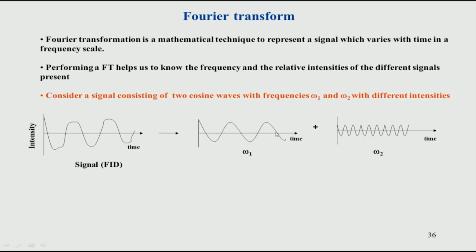You can see the frequencies are not the same now because they are two different atoms in the same molecule, and therefore, they have two different frequencies. These two different frequencies also have different amplitudes. You see the height is also not the same here and here. That is because this particular frequency may come from 3 hydrogen atoms, so 3 times the signal of this one, which may come from 1 hydrogen atom. That is the difference in NMR.